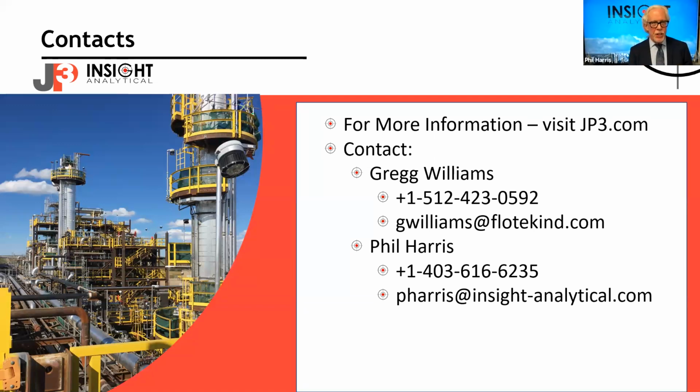Yeah, this is why people use ATR cells in the mid-infrared. Right. So you end up having to use ATR cells, and that has a whole set of issues associated. I have an FTIR in the lab with an ATR cell if I want to do mid-infrared, but you end up wanting microns of path length, really. Or alternatively, go to gas phase, heat the sample, and bring it to gas phase. And that's the whole thing we wanted to avoid. If it's a liquid sample, we want to measure it as a liquid. As you try to take a sample of condensate and make it into the gas phase, the heavy ends don't vaporize properly, and everything starts to plug off. Sure. Yeah.